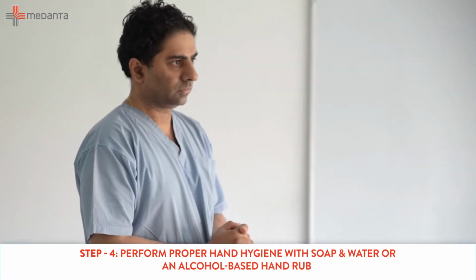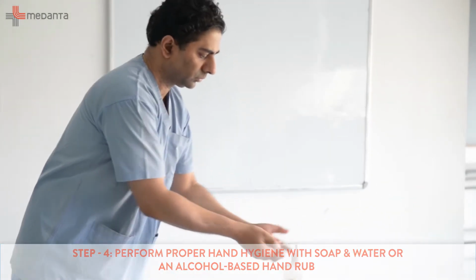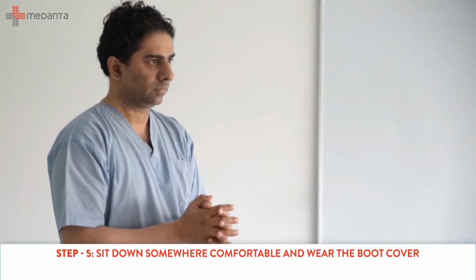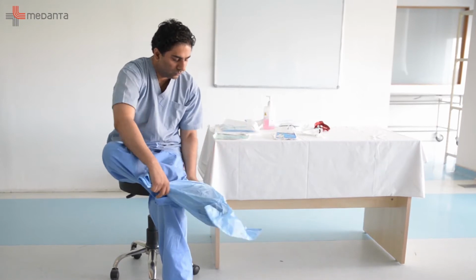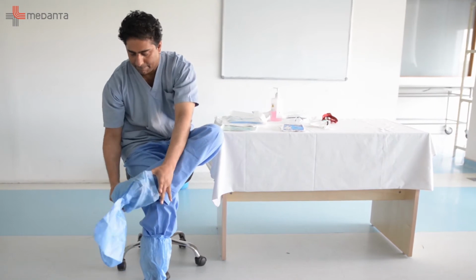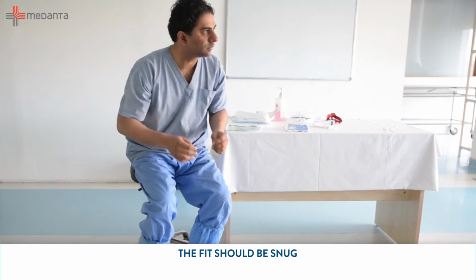Step 3. Remove all personal items and make sure your hair is tied back if you have long hair. Step 4. Perform proper hand hygiene with alcohol-based rub. Remember all the 6 steps of hand hygiene? Okay, then step 5, sit down somewhere comfortable and wear the boot cover. The fit should be snug.